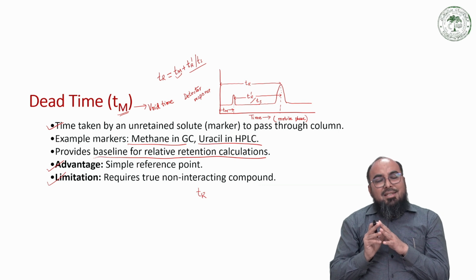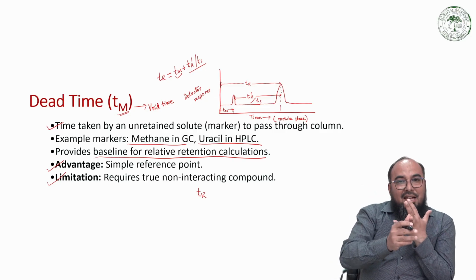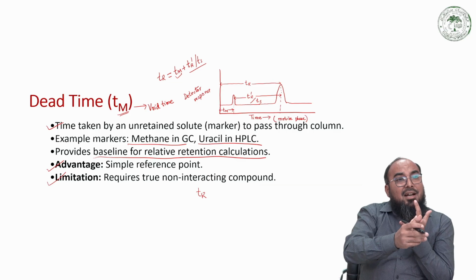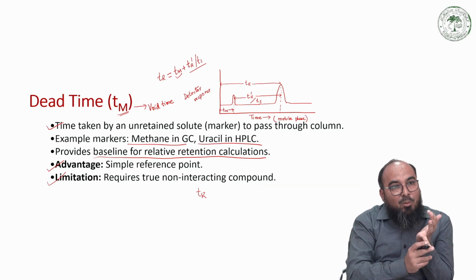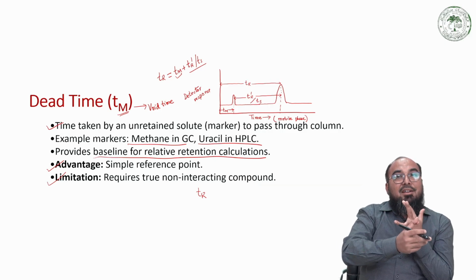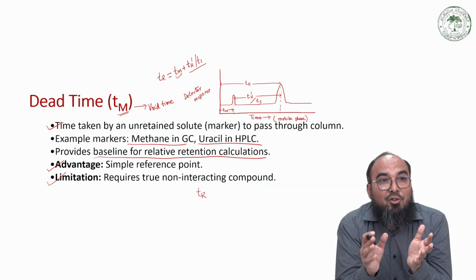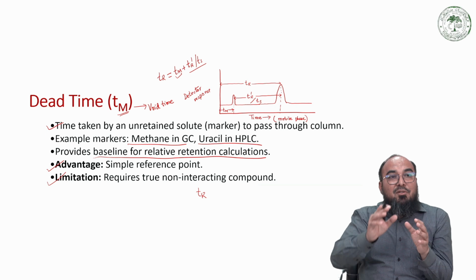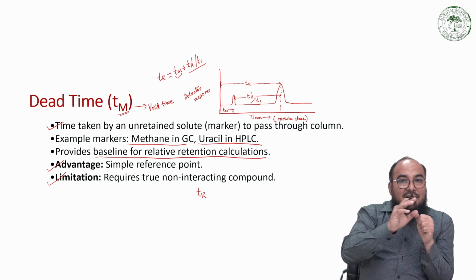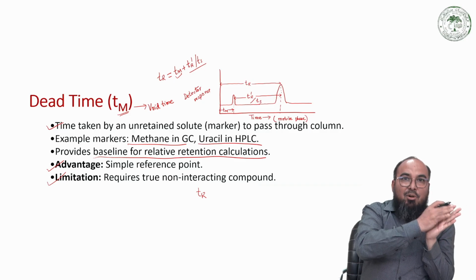On the basis of time, you have quantified it in three terms, that is the Tm, the Tr, and of course the Tr dash or Ts. So you have accounted for the interaction of the mobile phase, and you have also accounted for the interaction of the stationary phase. And all these three quantities you can measure directly from the chromatogram. So what is the difference between KD and Tm, Tr and Ts is that the KD gives you a very good idea about the column performance.